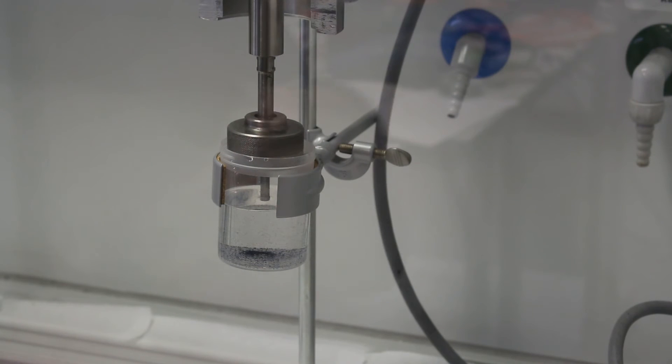which leads to this cavitation process. So, it's like you are inputting energy into the water, and due to the cavitation, there are shear forces. And you will see what this means in practice.